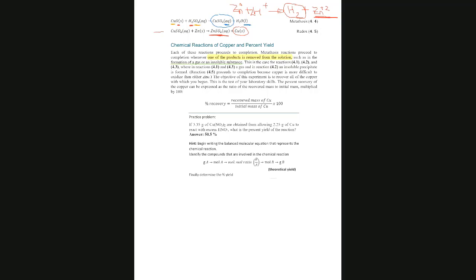And then we wash the copper, which is a black precipitate, with water many times. I think it was the first experiment that we learned the process of decanting. What is decanting? We add water and we decant. Very slowly we leave the solid on the bottom and we pour very carefully so we don't disturb the solid at the bottom, and we remove all the impurities. And we wash that with water several times.